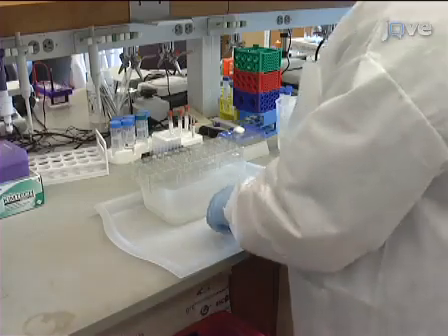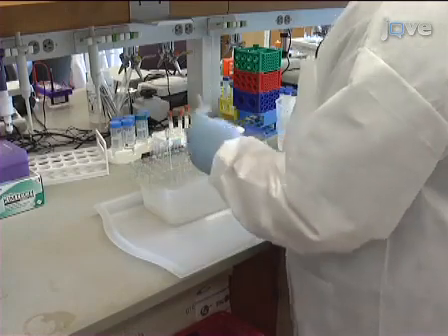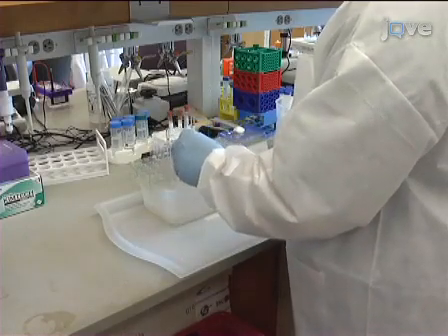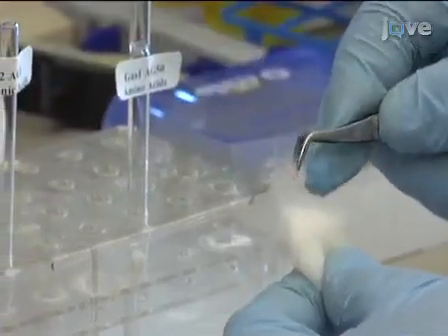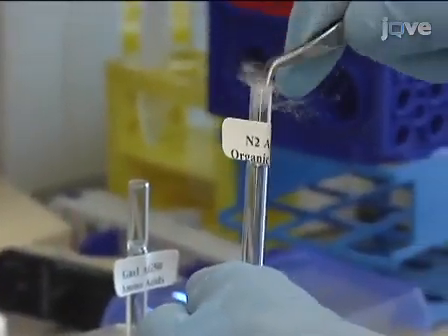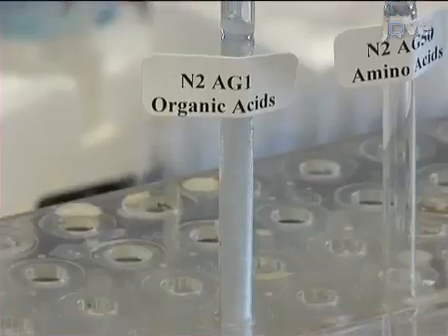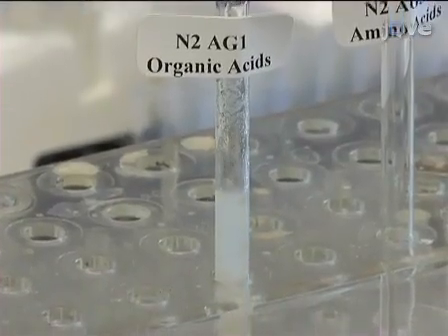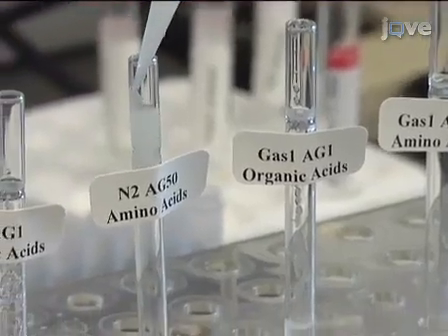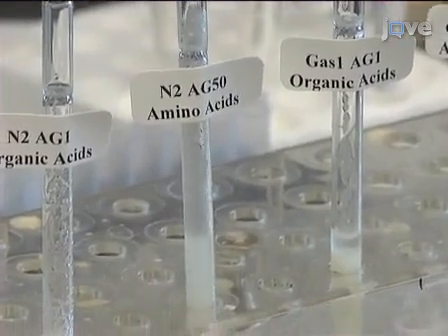Next, we will show our method for preparing custom-made, low-cost columns using glass pipettes. Pre-made columns are also commercially available. To prepare a column, use forceps to insert a cotton plug just above the narrowest part of a Pasteur pipette tip. Use Ag1 beads for organic acid extraction and Ag50 beads for amino acid extraction. Fill each column to approximately 1/3 of the column height.